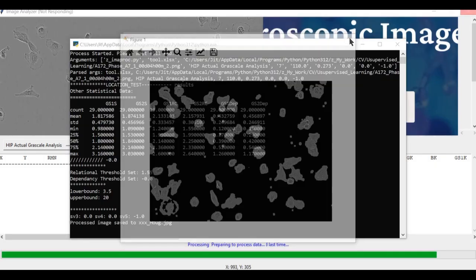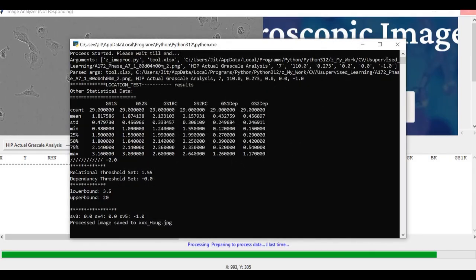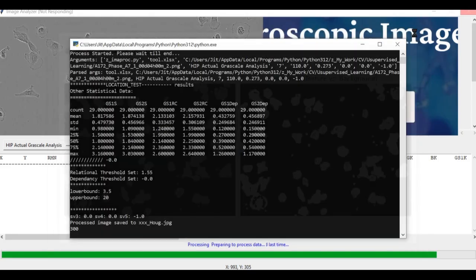The steps and different stages of semantic segmentation are displayed during this process. Here the system yields the first intermediate output based on the probable homogeneous image plane, which is a very rough roadmap for the system.